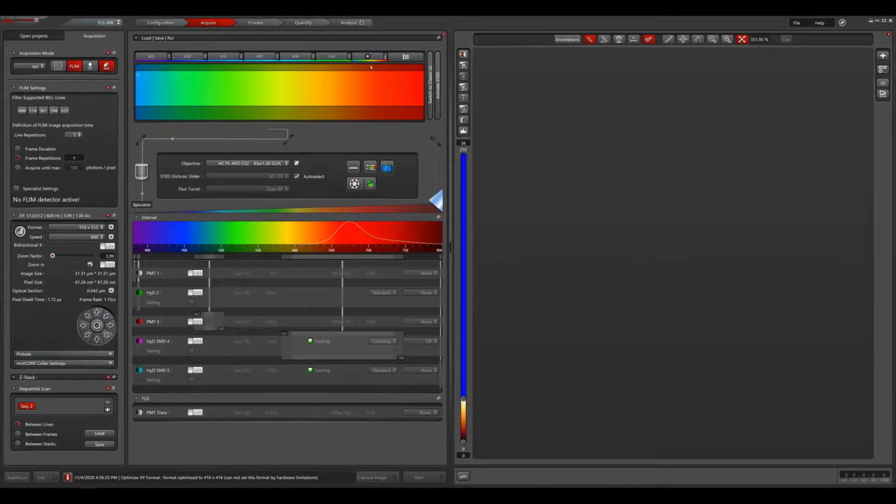And now let's first try to get a confocal image. I will activate one of our white light laser lines and place it in an excitation range, which is optimal for Nile red. As I know the sample already, I can tell that we are fine with a rather low intensity here, as the signal is quite bright. And then I will also activate one of our hybrid SMD detectors, which are suitable for imaging with confocal and Tau-STED, as well as FLIM microscopy using our FALCON.